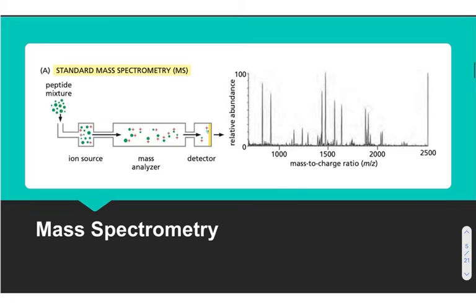Usually in mass spec, I've never seen it different than this actually, the charge is +1. So the mass to charge ratio is really a fancy way of saying the mass. The mass spectrometer contains a magnetic field, and that magnetic field is going to curve the paths of things by different amounts, and that's dependent on the mass.